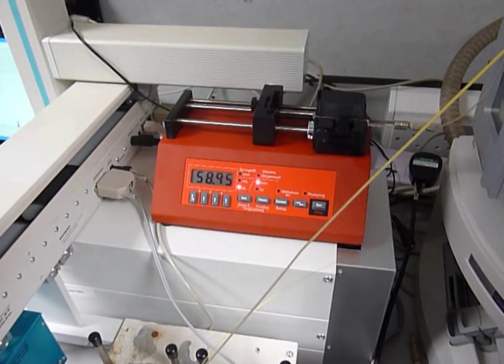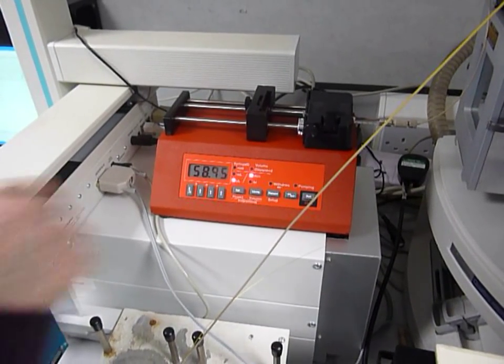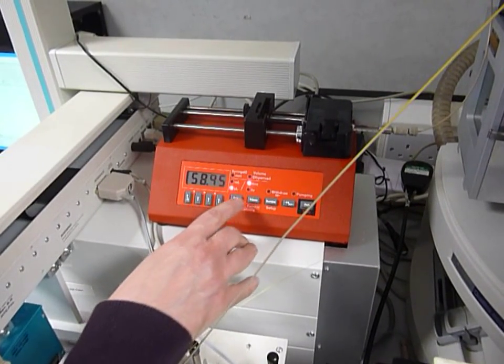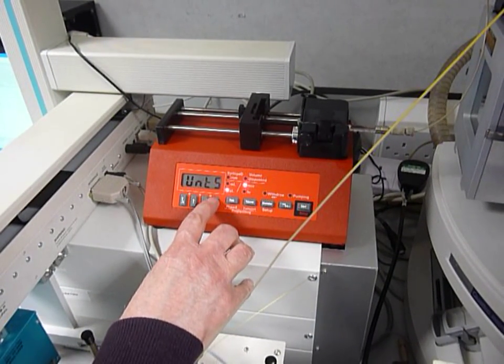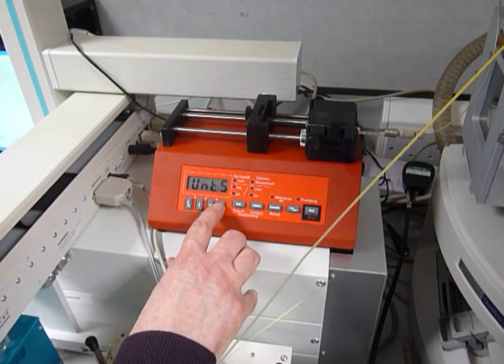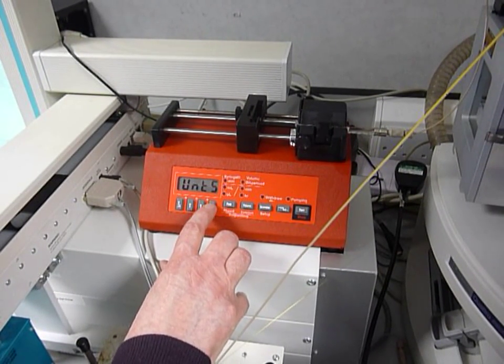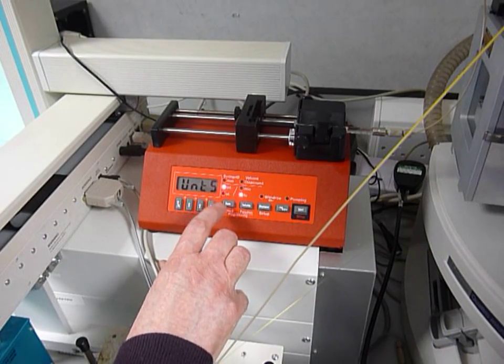First of all you need to set up the rate that you want to infuse. In here at the moment it's at two microliters per minute, but with it actually off you can actually change that to various units, either mils per hour or microliters per hour. In my case we then change it to mils per hour.